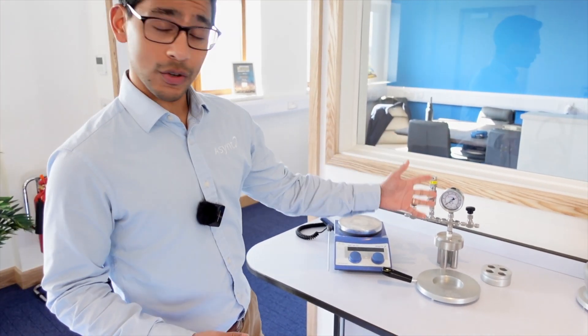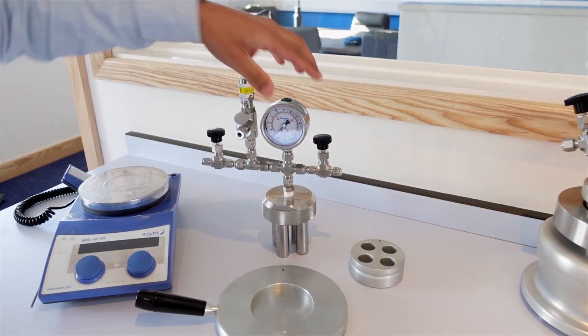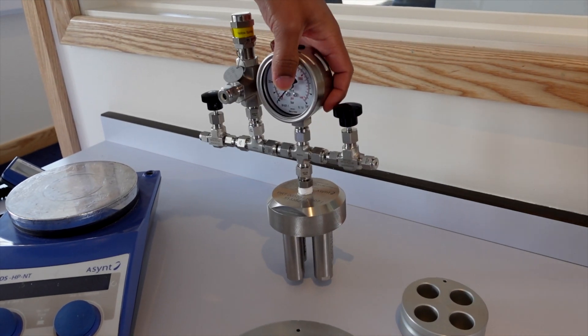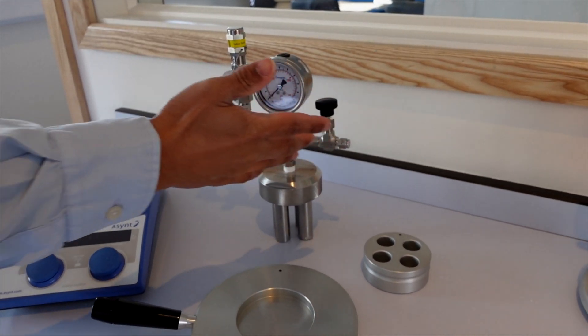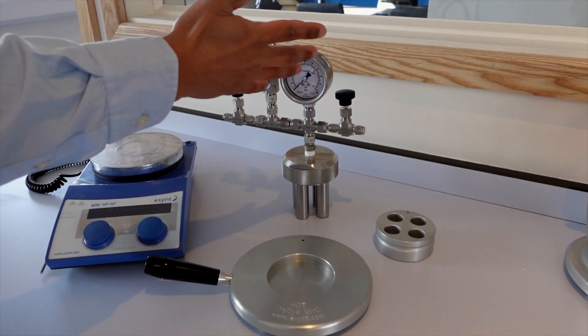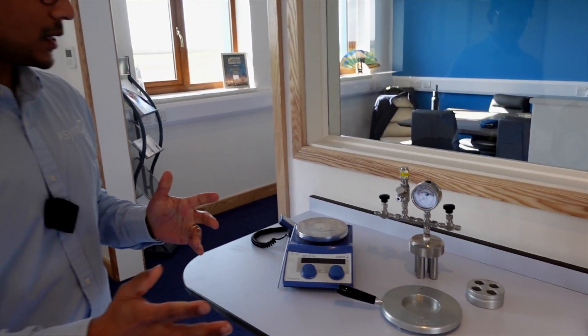So this is our QuadraCell high-pressure reactor. You get four cells, individual, in one reactor, each at 10 ml capacity. It comes with a common gas inlet, outlet, gauge, and a relief valve. So ultra-safe and can run a variety of different conditions and materials.